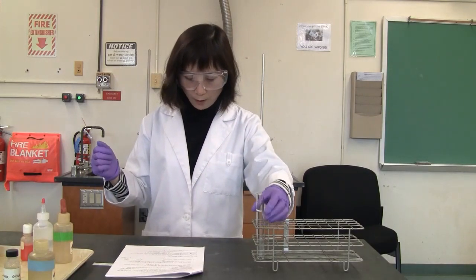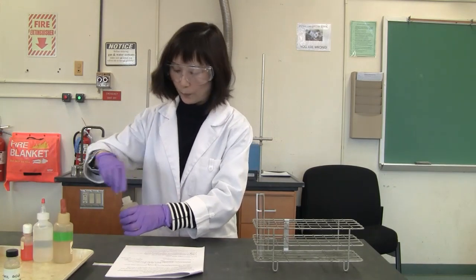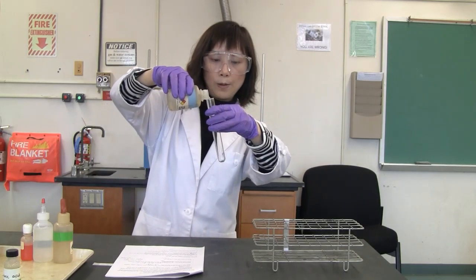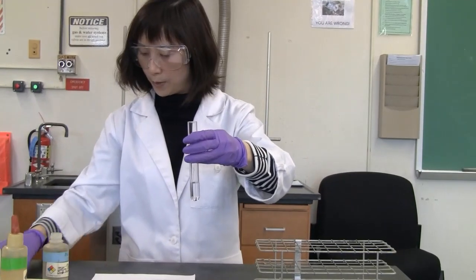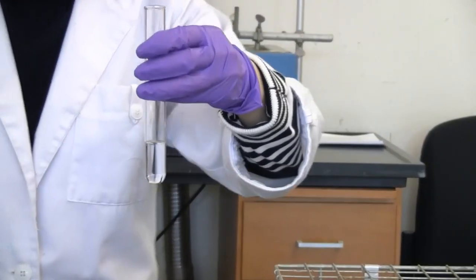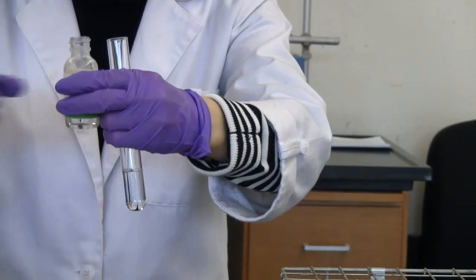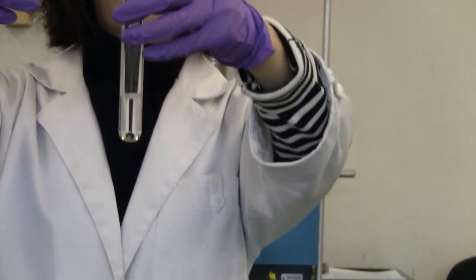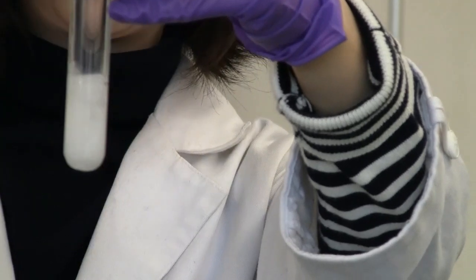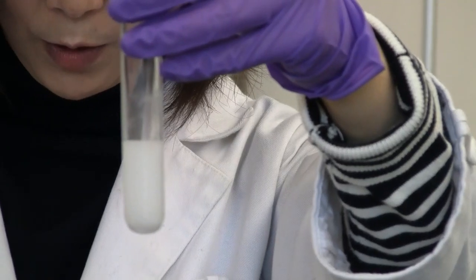So I'm going to put 5 milliliters of saturated sodium chloride. This time you have to observe very closely, okay? So about 5 milliliters. I'm going to add 2 milliliters of 12 molar HCl. You're going to take a close look and describe the change. The change is quite dramatic. So you're going to describe it.